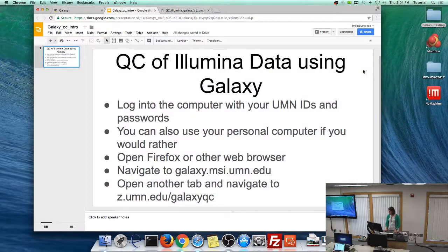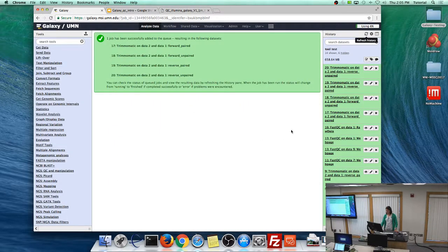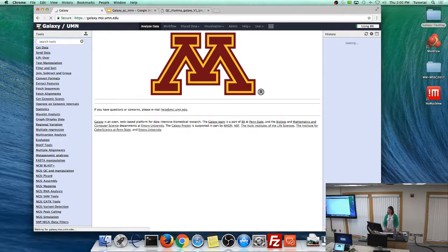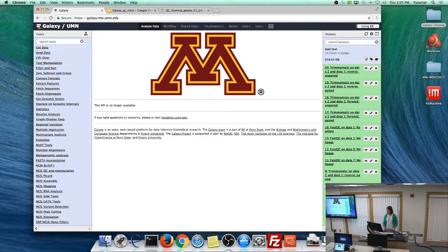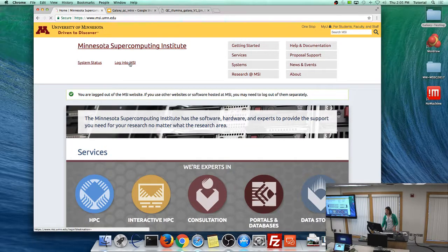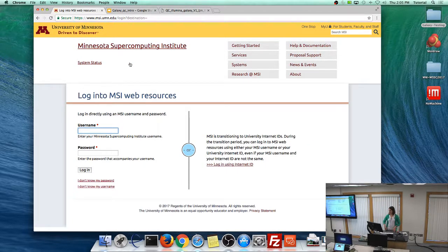When you guys log into Galaxy, there are lots of Galaxy instances on this planet. The University of Minnesota and MSI hosts this instance, so it'll have a big M in it. When you log in, you'll see your username and a drop-down that includes 'tutorial.' Select that option to get into a special priority queue so we can get through this faster today. Log in using your U of M credentials.